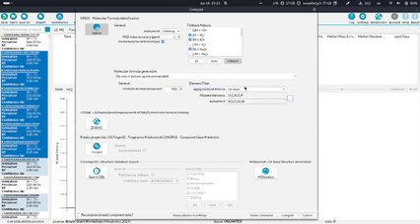As I said, by default, this filter is only applied to the de novo molecular formula generation, meaning you can still find many compounds which have other elements by this bottom-up search. But if you really want to restrict your molecular formula generation to some specific elements, you can change the option here to apply the filter also to bottom-up.